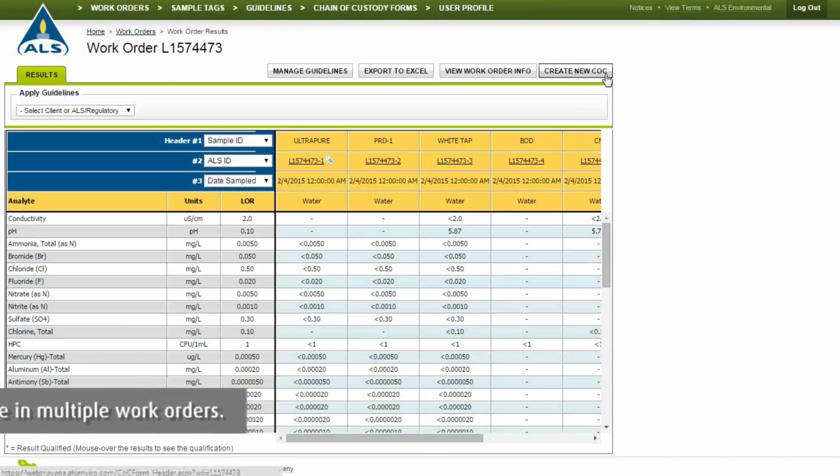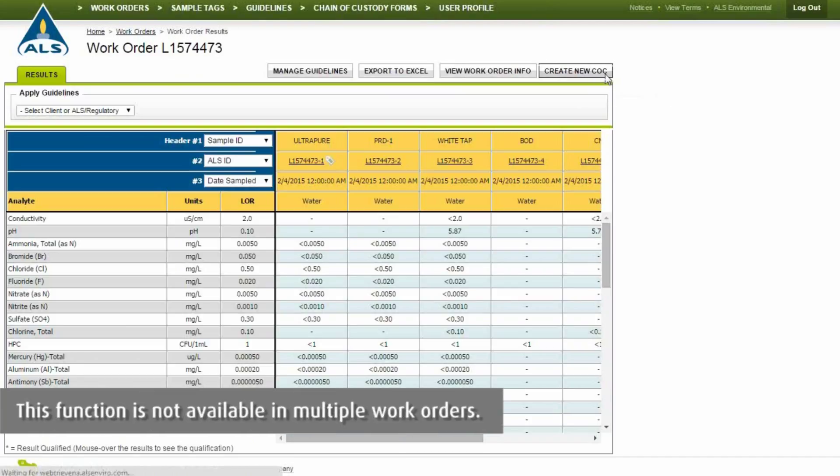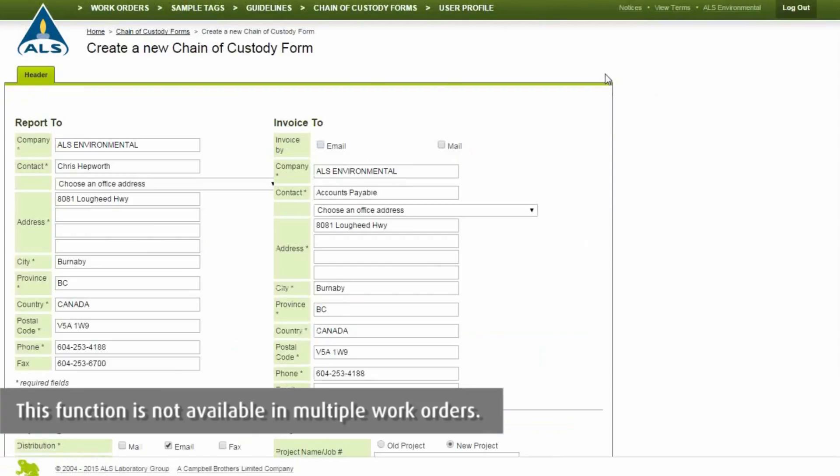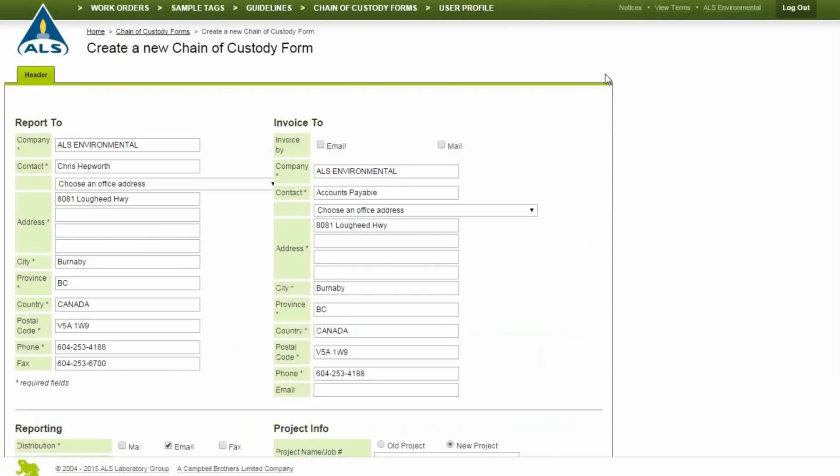Click Create New CoC to generate a new chain of custody form from an existing work order. The work order information will be automatically populated into the new chain of custody form. Edit the information as needed and click Submit and Add Samples.